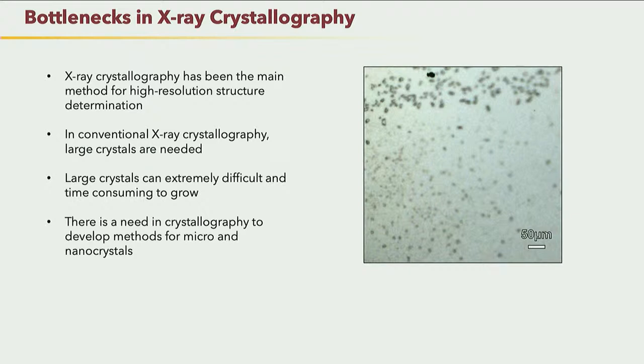So there's a need in crystallography to be able to study smaller and smaller crystals. And something we didn't appreciate is that this need also exists in the small molecule community. We were a bit naive and thought small molecule crystallographers can always grow big crystals, but that's actually not the case either. So this also holds true for small molecule material science.